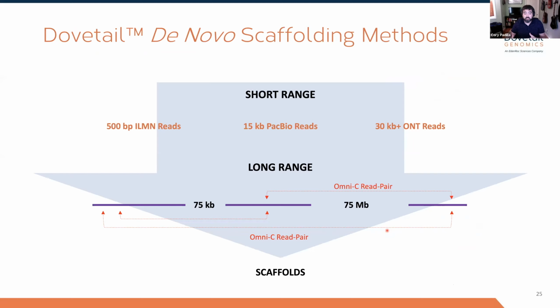We started as a genome assembly company really using that long-range information to piece together these scaffolds over megabases, right? And because the physical distance that our reads span is limited only by the length of the chromosome, we actually consider PacBio and Oxford Nanopore as short-range reads. You're talking about kilobases. The Hi-C data type, you're speaking in terms of megabases, right? So that really allows you to piece together the contigs into these really nice long scaffolds that are almost the size of the chromosome.